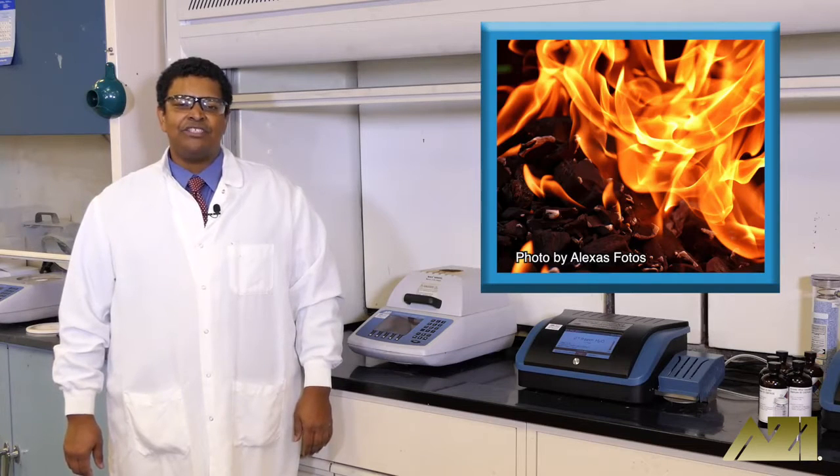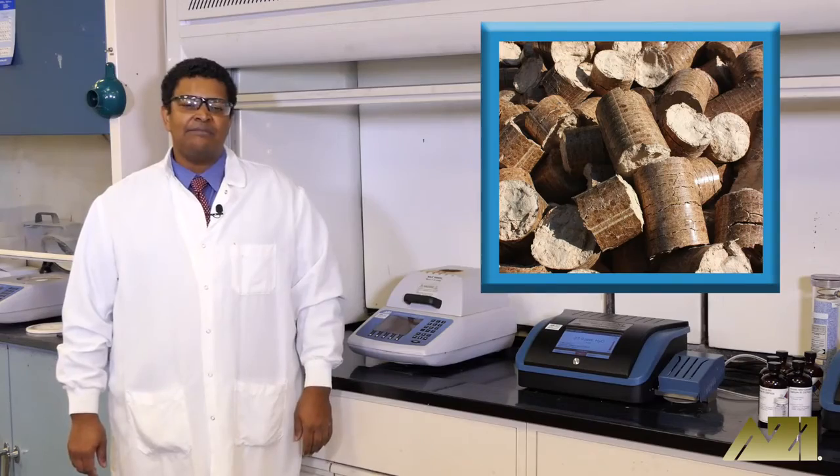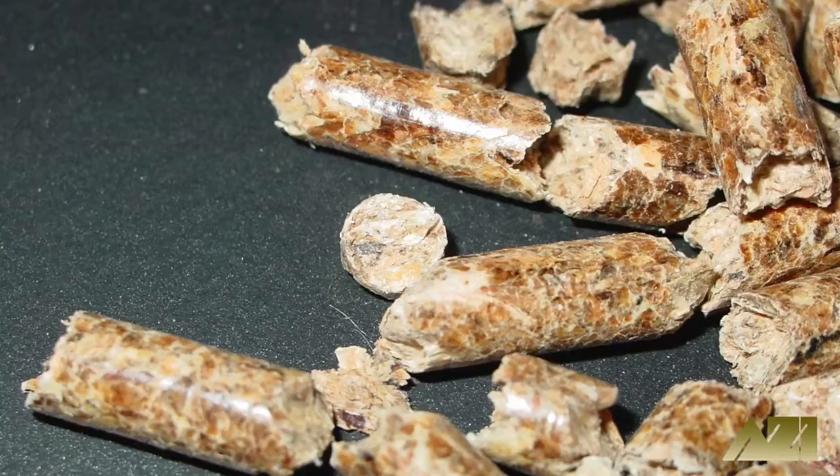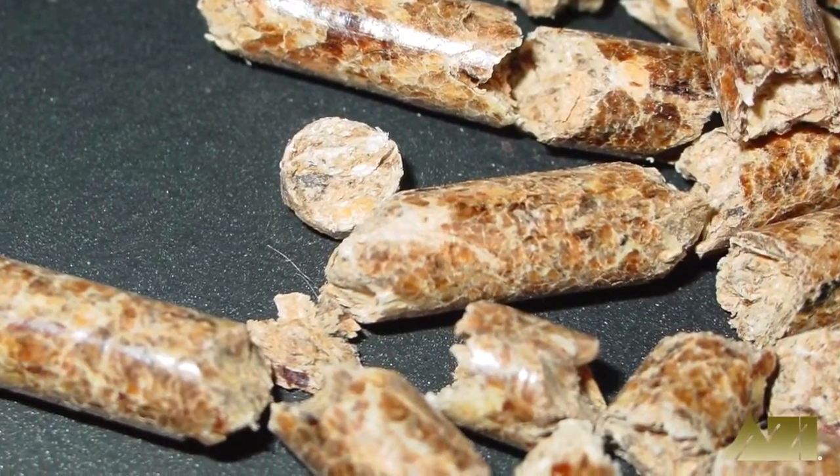An excess of moisture decreases pellet density and durability resulting in a weakened, sometimes even soft final product. Too little moisture on the other hand can lead to fragile cracked pellets and charcoal.